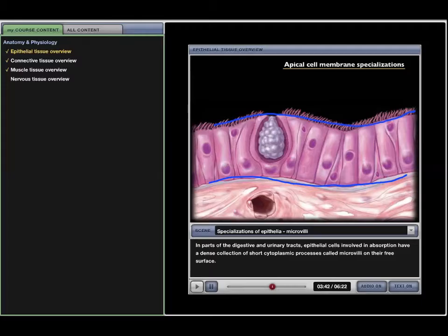I want to give you a quick tip on finding a simple squamous epithelial cell. If you look in the connective tissue beneath the epithelium, you can sometimes find small blood vessels in cross-section. And here's an example. So that blood vessel is in the connective tissue that's beneath this epithelial cell layer. The walls of these blood vessels are made up of simple squamous epithelial cells. And here you can see one in cross-section right here.